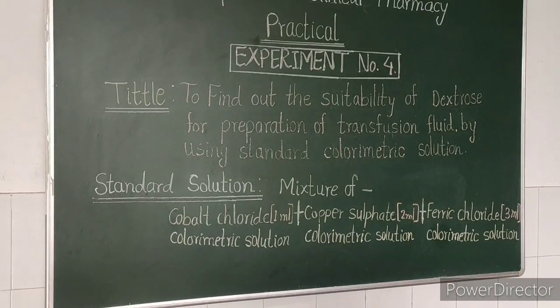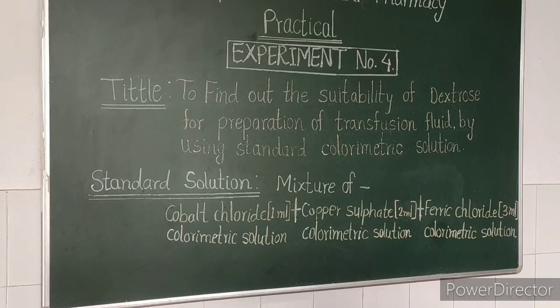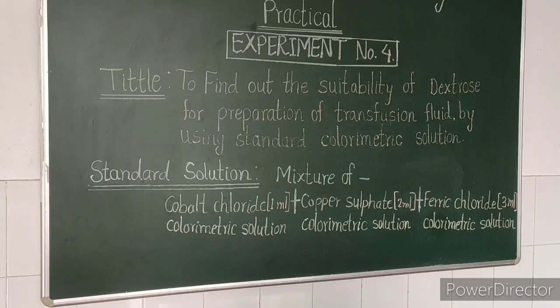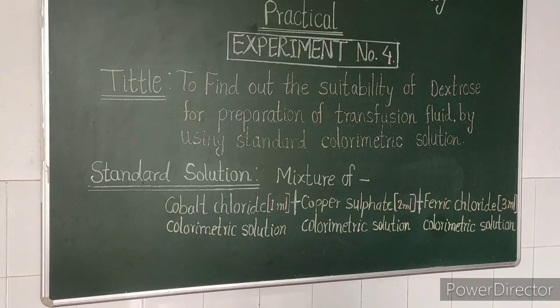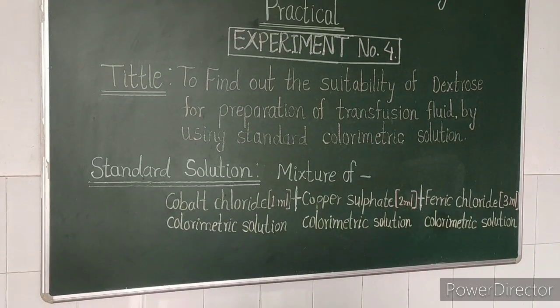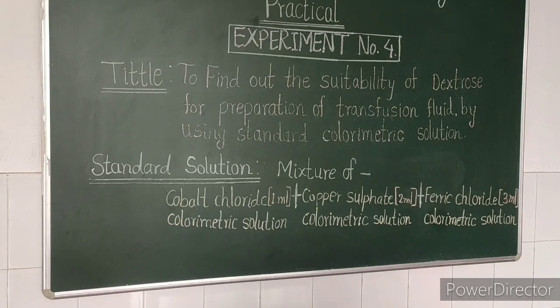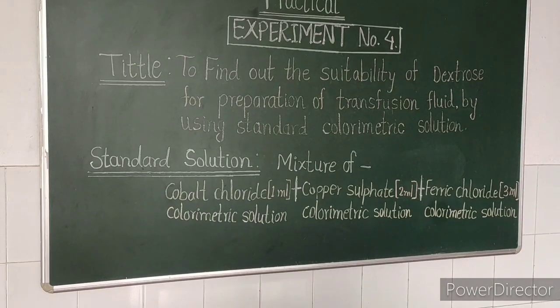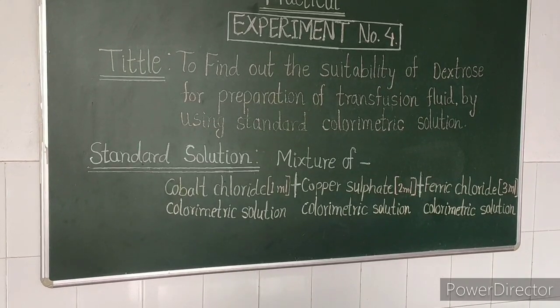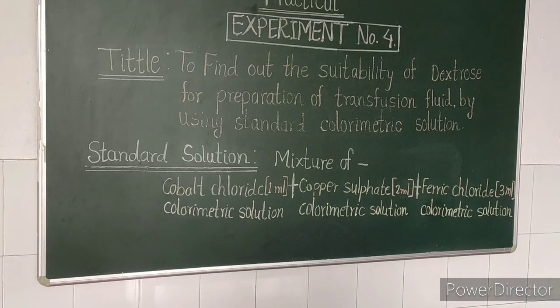For this experiment, we prepare a standard solution. Standard solution is a mixture of cobalt chloride colorimetric solution 1 ml, copper sulfate colorimetric solution 2 ml, and ferric chloride colorimetric solution 3 ml. The ratio used for this standard solution is 1 ml, 2 ml, 3 ml. This is our standard solution.